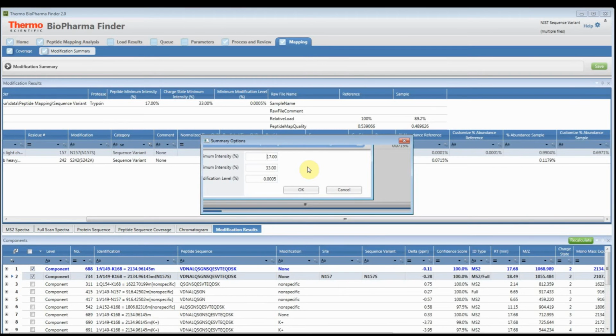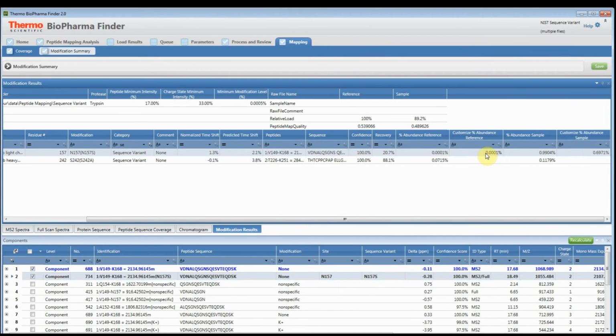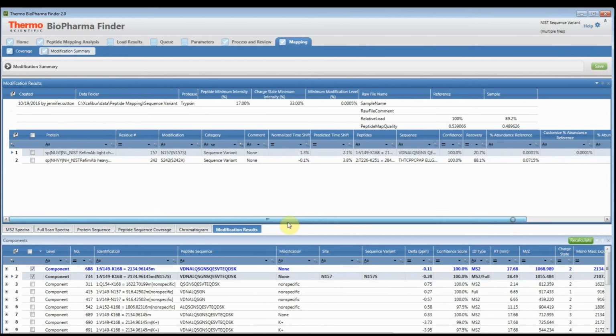And so when you're telling it to do your calculation, it's ignoring these, and it's using the values that you tell it. Okay, so it's ignoring the parameters, but it's using the components that you actually tell it. So now that you have that in there, you can save it. So you saw that it said to save it.